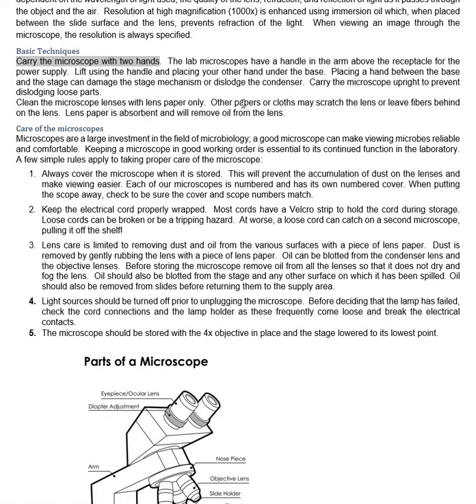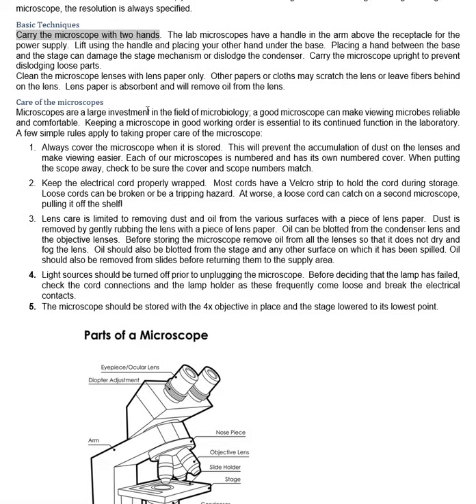Now, there are several kinds of papers in the lab. You have lens papers. Guess what? Those are for lenses. Makes sense. You've got chem wipes. Those are not for lenses. Those are for wiping off slides. We only use lens paper on lenses. Any other kind might scratch or leave fibers behind. And since the lens paper is absorbent, we also use it to get the oil off the slide and off the bottom of the objective, the 100X.